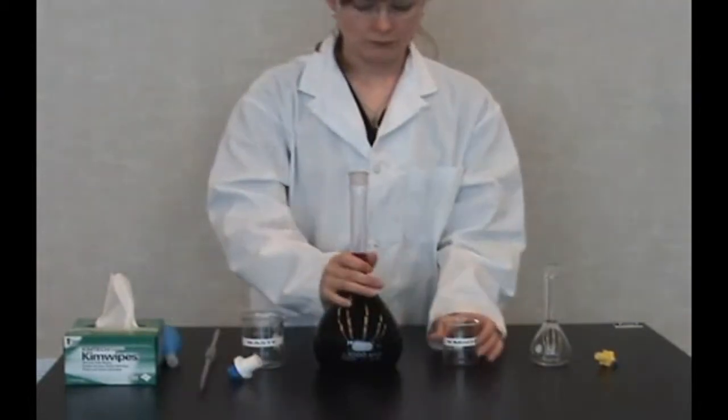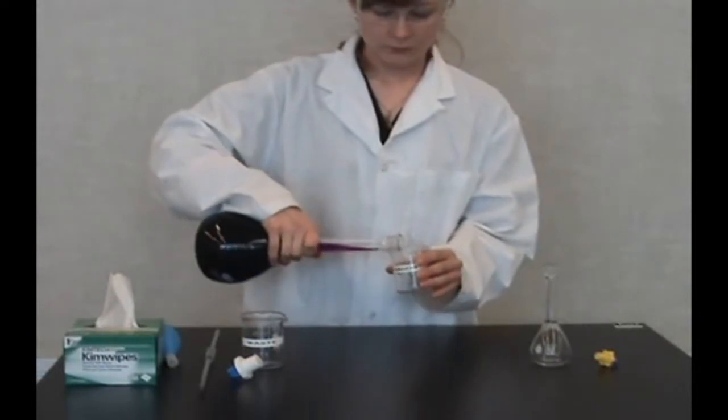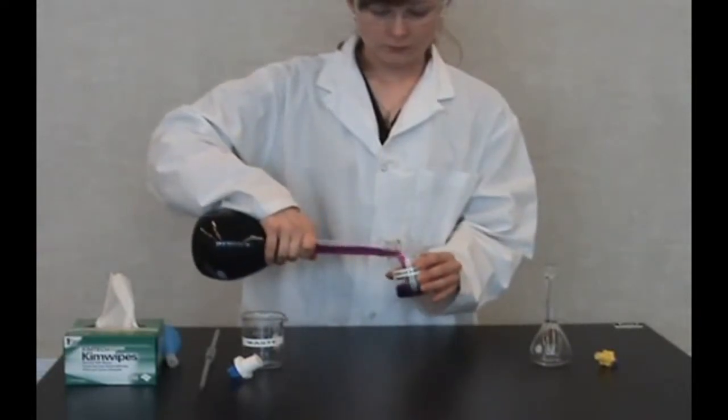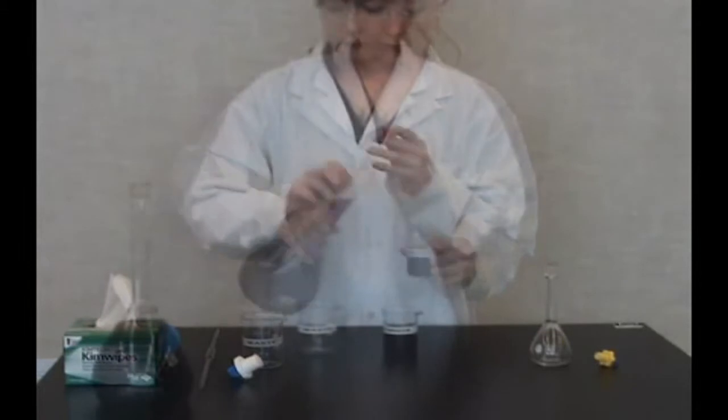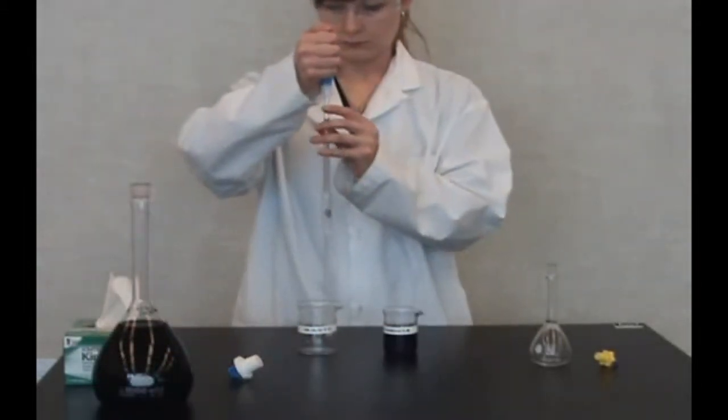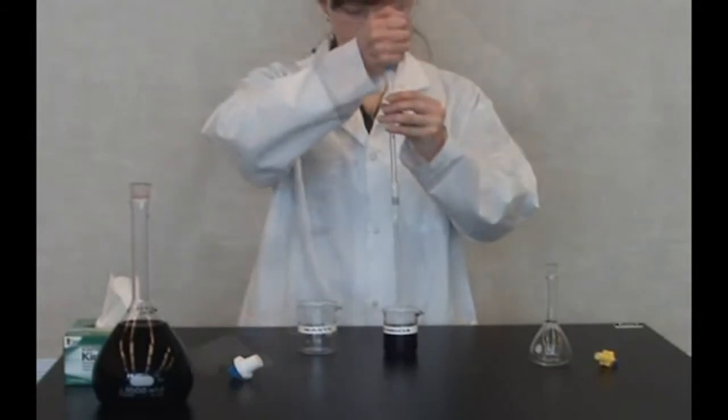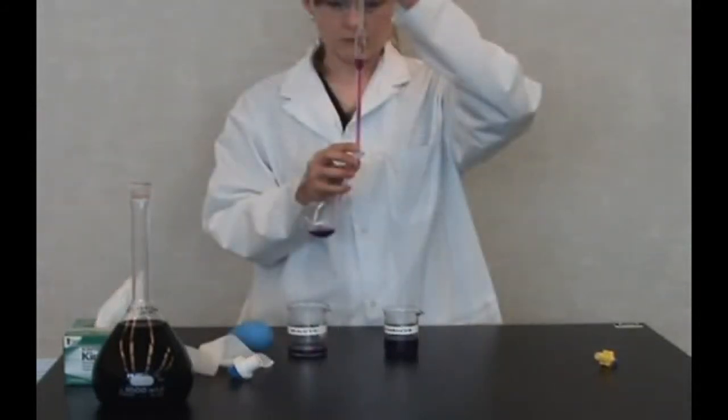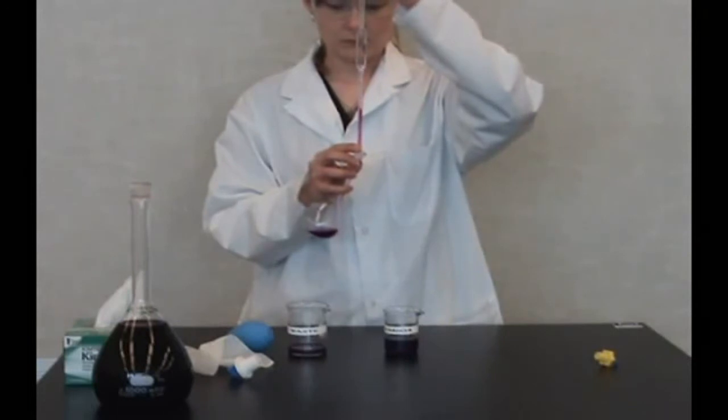Remove the stopper and pour some solution into a beaker. Take a 10 ml pipette and deliver the aliquot of solution into a 100 ml volumetric flask. For further instructions, review the pipette technique video.